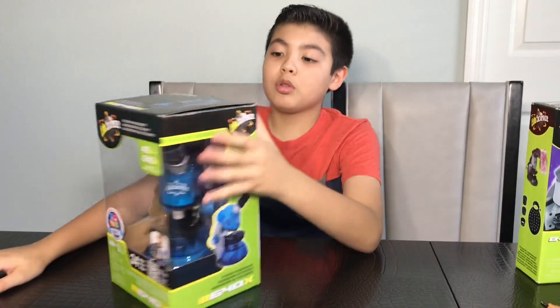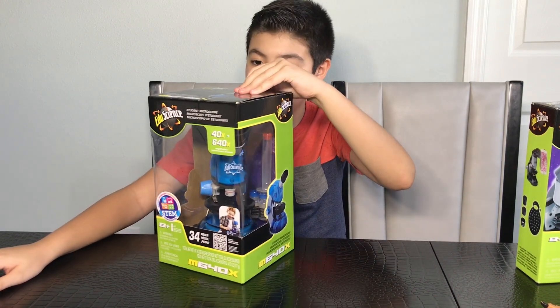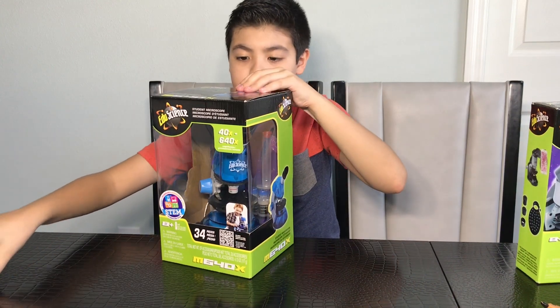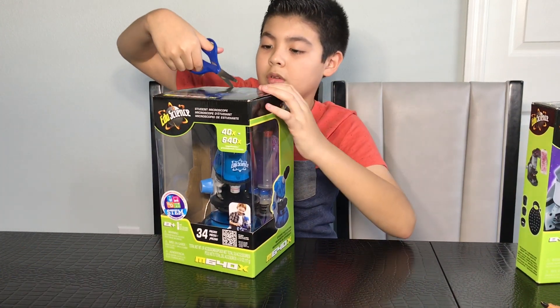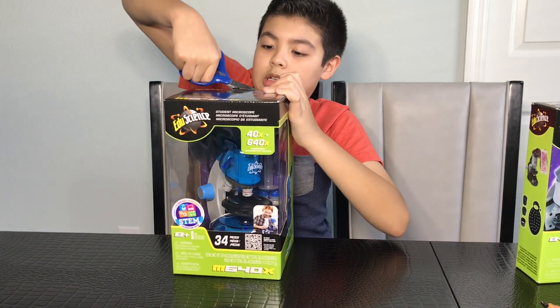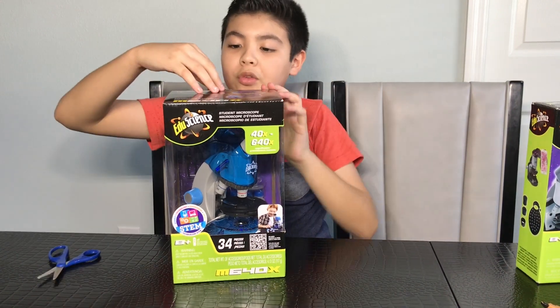So it goes with the 640x — wow, that's a lot. Let's get this cool thing open. I think there's some tape up here. Yep, there is some tape up there. We're just going to cut through the tape here. Now we can lift this cool thing up.